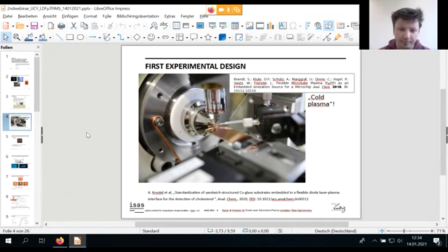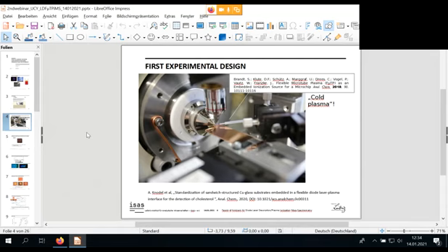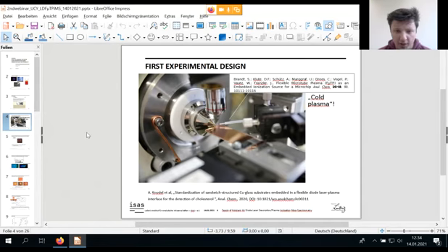Another question: do you use a lens to focus the beam or not? We're using an objective, which you can see in the picture. Actually, it's from a microscope. It's put in a microscope revolver, and this focuses the laser on the substrate. Okay, so it's a lens system.